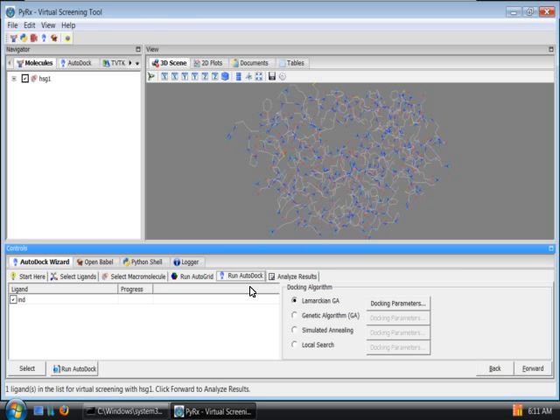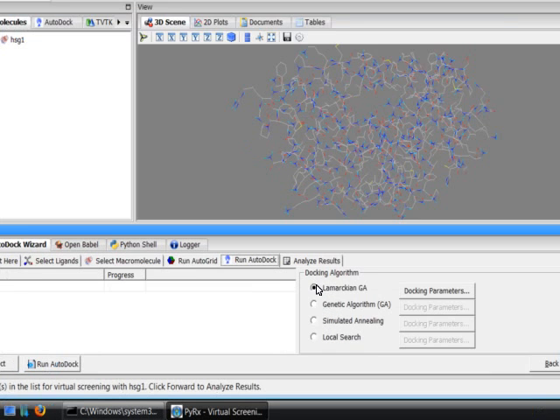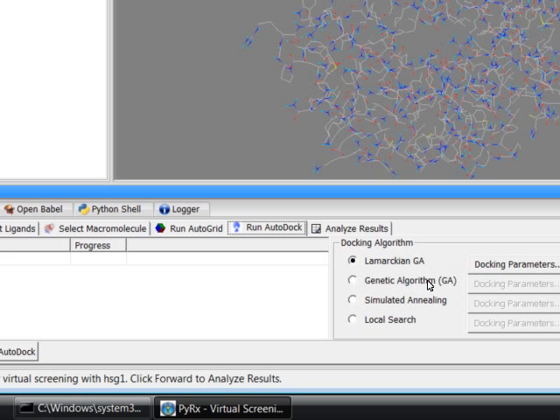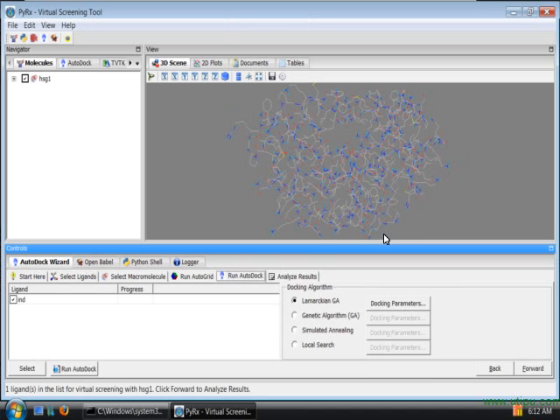This is Run AutoDock page and here we can choose among four different docking algorithms. We can also modify docking parameters but for this tutorial I'll leave everything to default and go to the next page.